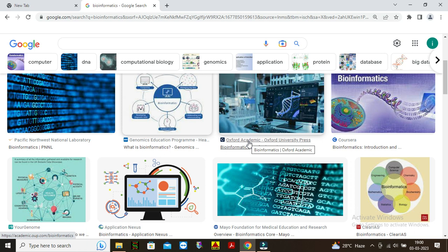Today we will see how we predict the number of disulfide bonds present in any given protein sequence. Disulfide bonds are sometimes called SS bonds. Actually, disulfide bonds are the covalent links between the sulfur atoms of two cysteine amino acids, and their formation stabilizes the tertiary and higher structure of the protein.